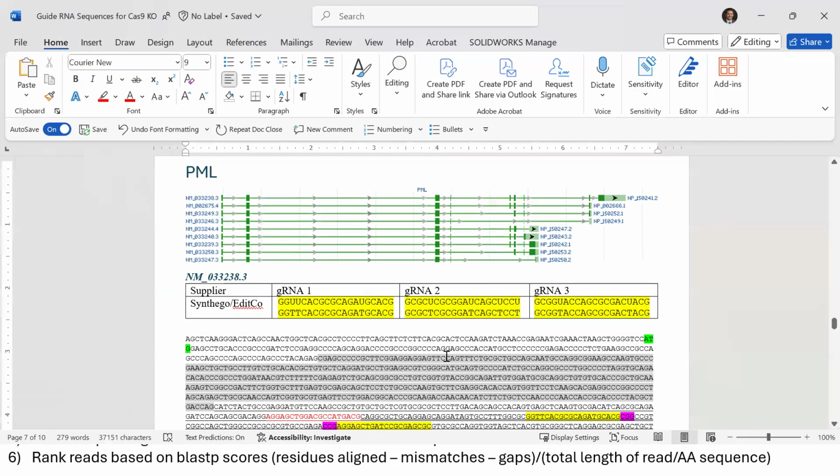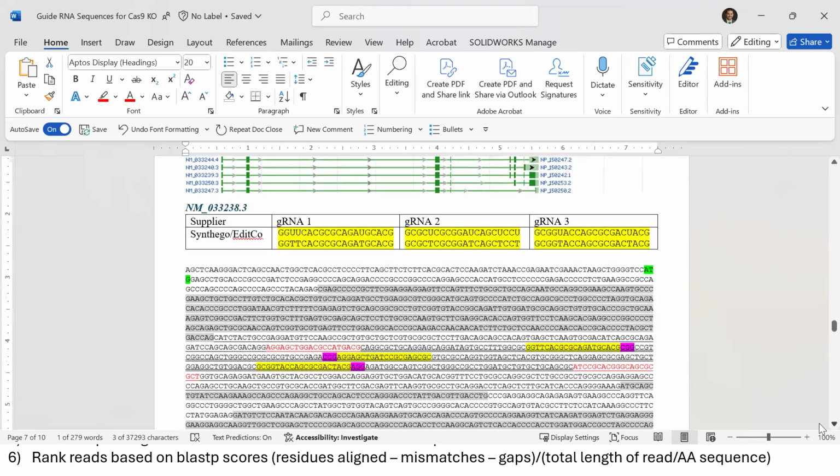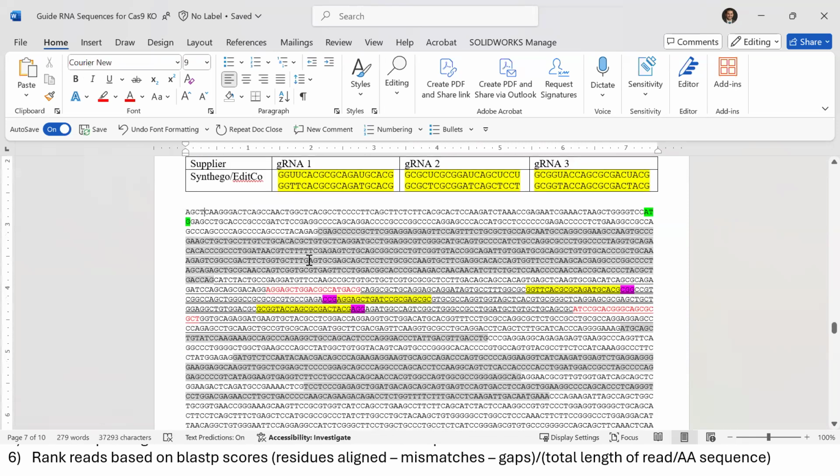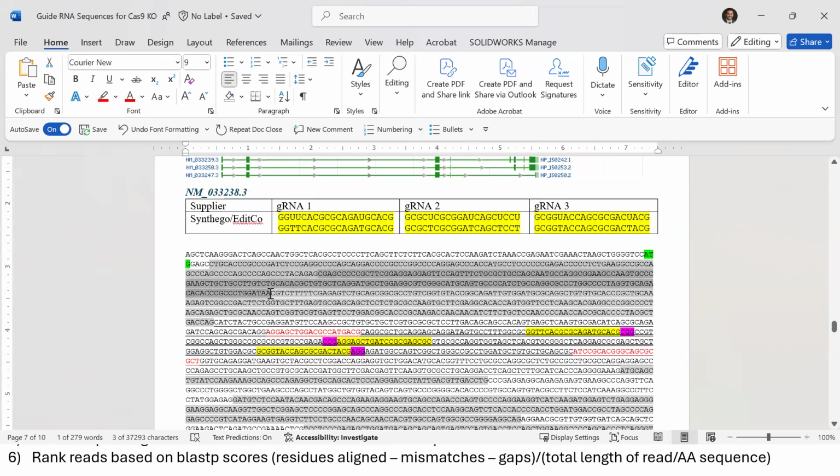specific example here. Okay, so here is one experiment where we're targeting this PML gene. Some things you need to know about PML. First of all, there's multiple splice variants of PML. And so you can see that here. So there's 1, 2, 3, 4, 5, 6, 7, maybe 8, up to 8 exons. And those are shown in the transcript sequence down here. So the first exon is in white, second exon in gray, and it alternates after that. You can see the start codon for the gene here, ATG. So that's the beginning of the coding sequence that then goes through exon 2.